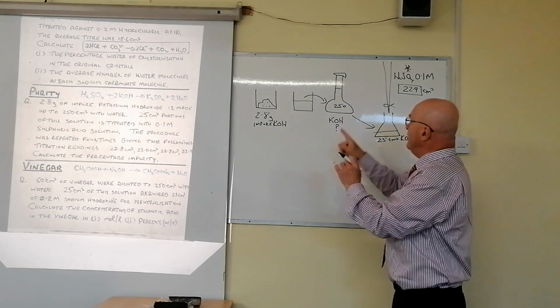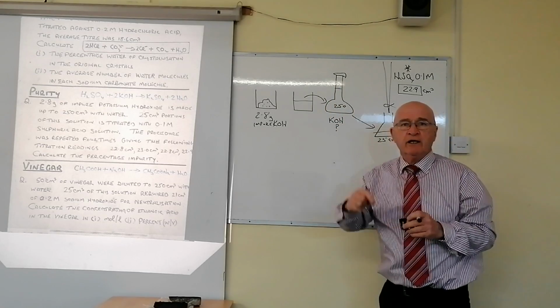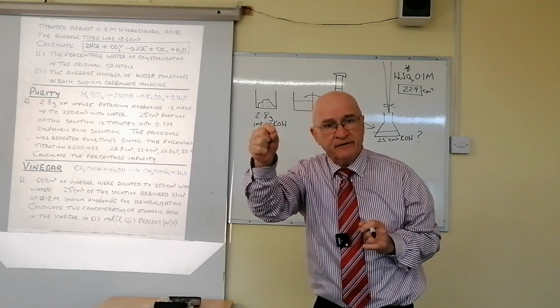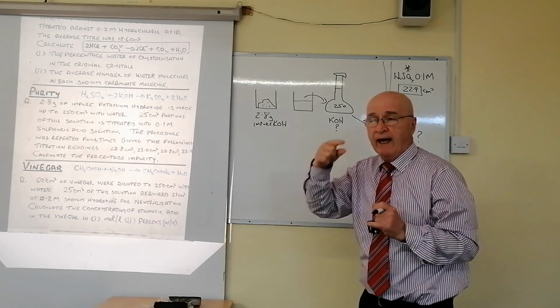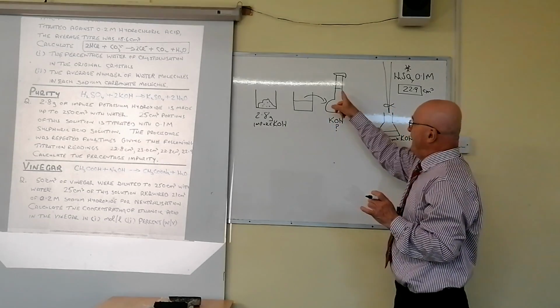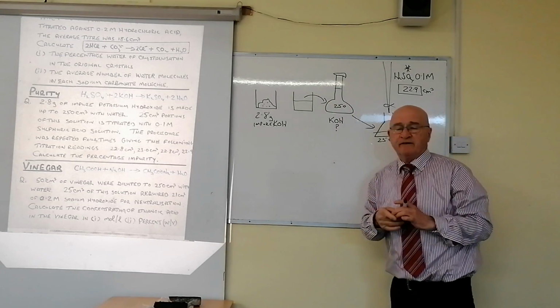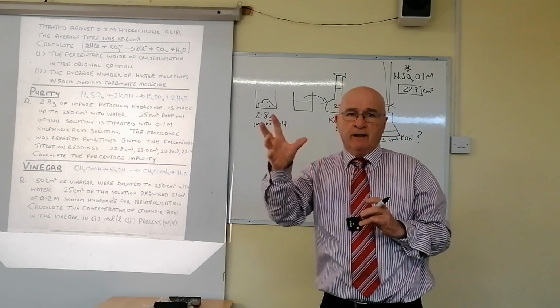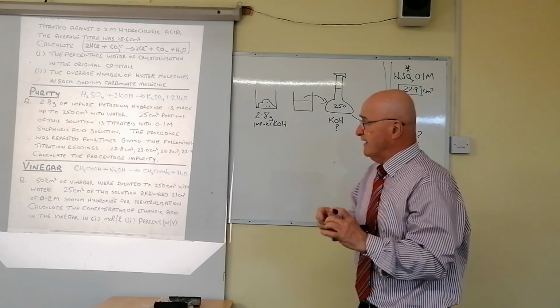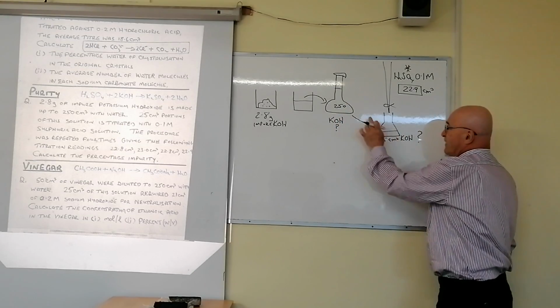And wait for it. When the liquid is about 1 centimeter from the graduated mark, remove the funnel. Now, if you put it in, you must remove it. Remove the funnel. And finally, using a wash bottle or a dropper, add the remaining amount of deionized water until the bottom of the meniscus is at the mark. And then you stopper it and you mix it. Now, please, make sure you don't leave out any of those details. That's very important.